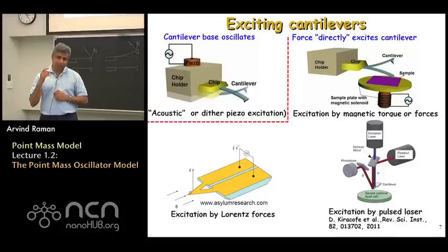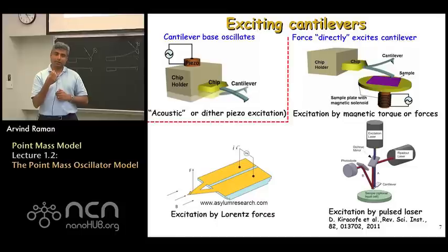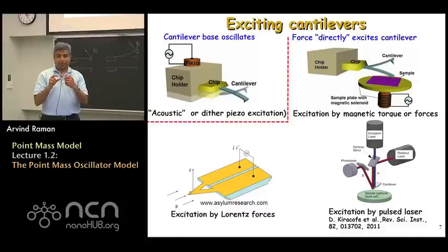There's a piezoelectric element that sits very close to where the chip holder is located, and a high-frequency signal is applied to this piezo, which generates a mechanical motion at that frequency. That motion gets transferred from the piezo to the interface material, to the chip holder, to the chip, and it causes the base of the cantilever to move up and down.